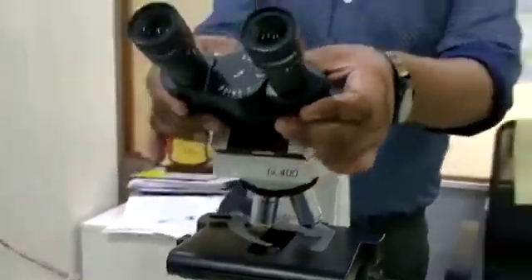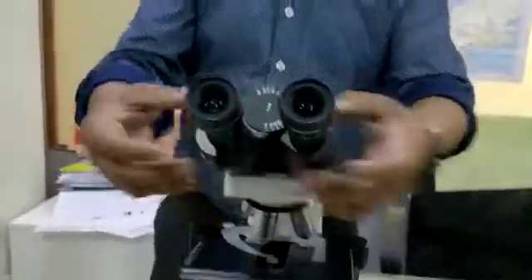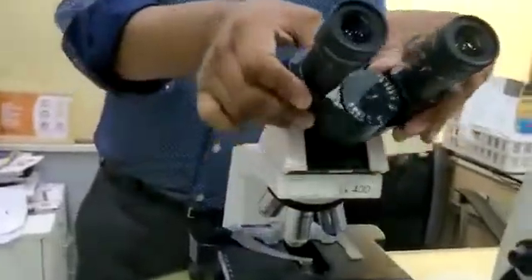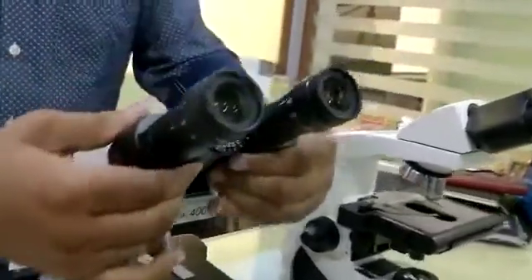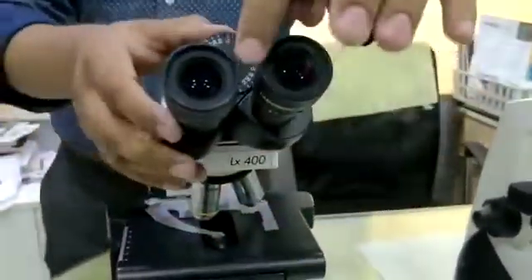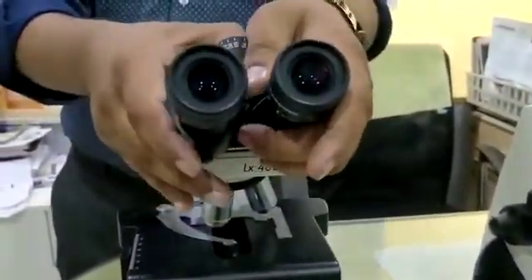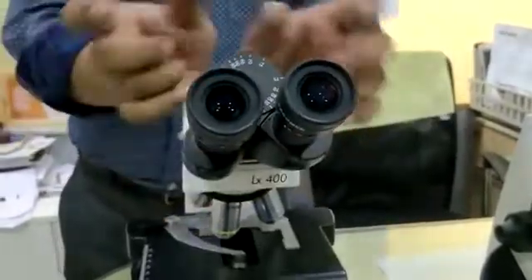Here we can straight away move it. Plus this is not a sliding head. This has silent movement and butterfly movement in the LX400. You can move it easily. Here you get more interpupillary distance compared to a sliding head.